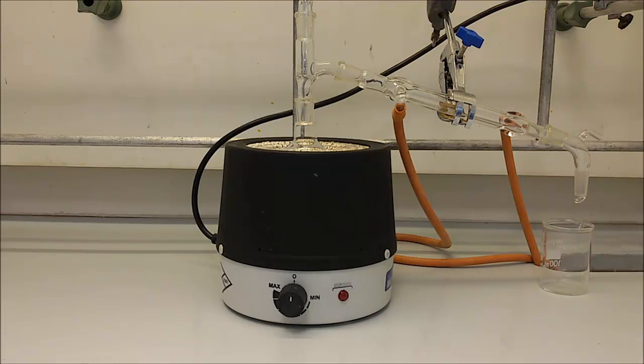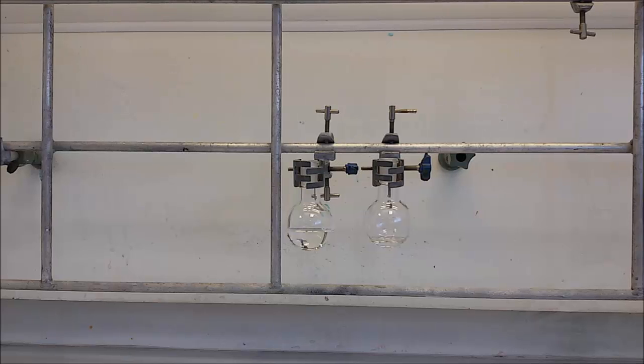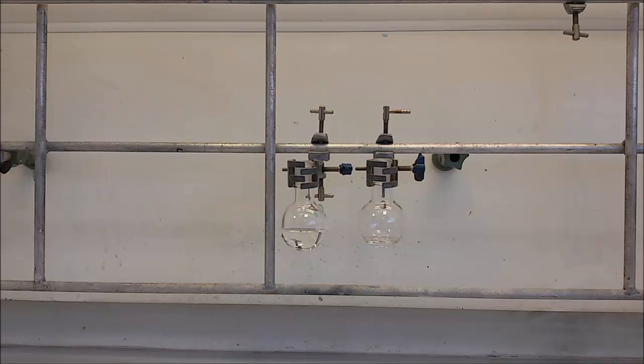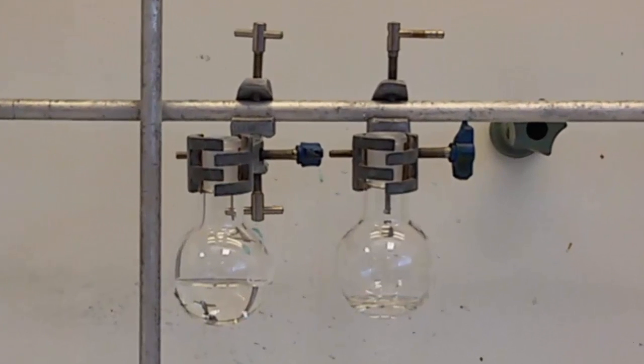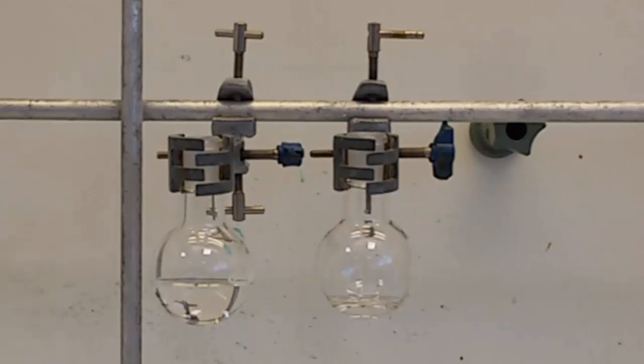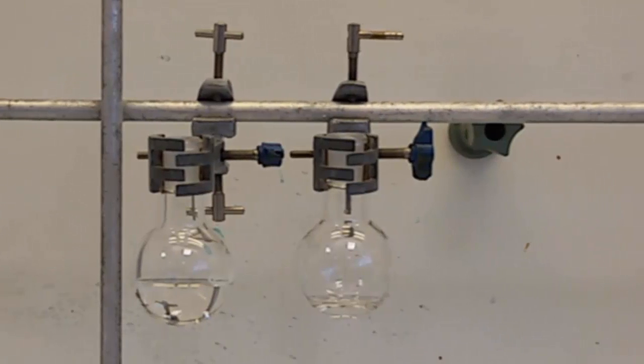When you switch the heating off, allow the whole setup to cool to room temperature and then switch off the water. To give you an idea of how much to leave in the flask, the left-hand side flask is the initial 20 ml of liquid and the right-hand side one is the amount to leave.